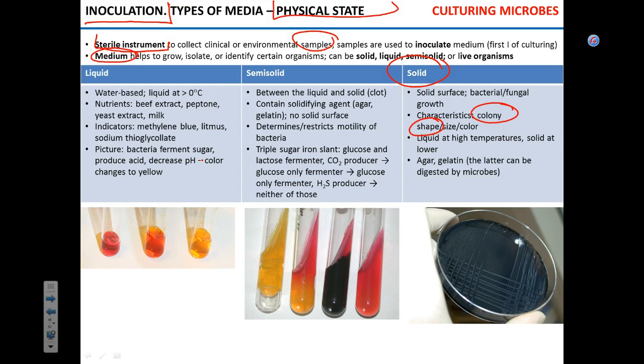An important feature of agar itself is that it is liquefiable, meaning it's liquid at high temperature and solid at low temperature. I don't know if you knew, but you can buy agar in the grocery store. It is used to make jello and other jello-type stuff. It costs a fortune, like a little tiny can for 10 or 15 bucks. But yes, you can buy agar in the grocery store.